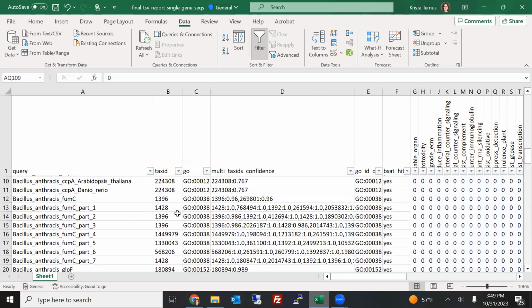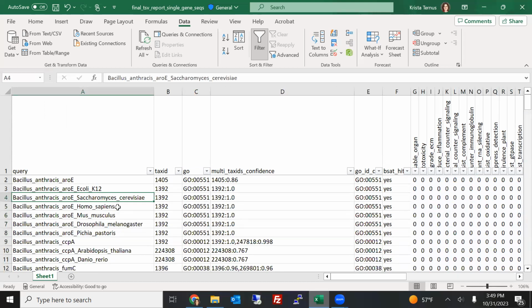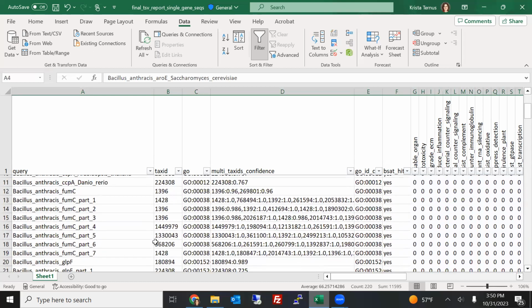It's also interesting to see how some of the different codon optimization processes for different organisms, so basically adapting the codons to be optimized to express in different organisms, didn't necessarily change results, right? These all look pretty similar, even though we've optimized them for different organisms, which I think is a good thing. It's showing the strength of SeqScreen reporting things consistently.